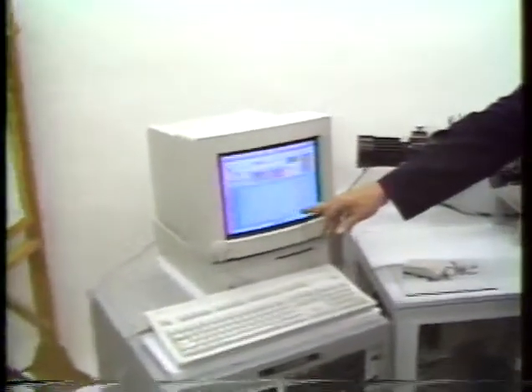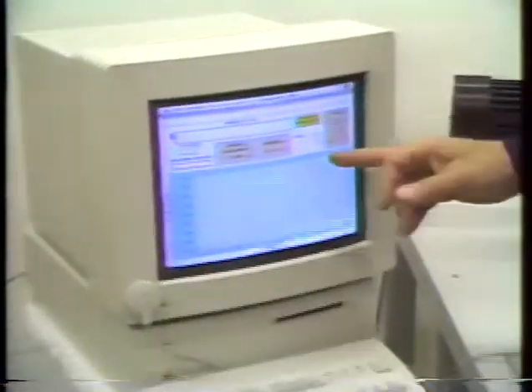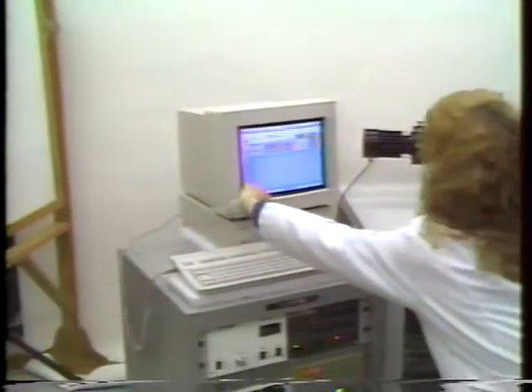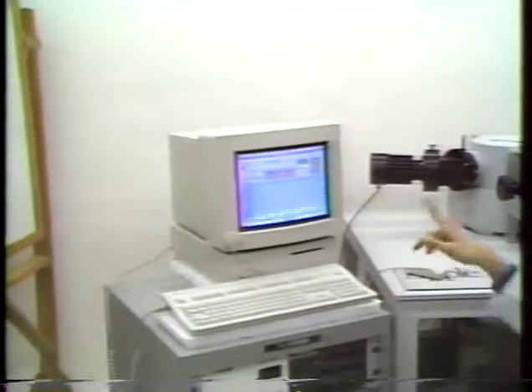These are steps of the 2 nanometers, which we had indicated before is the stepping speed of the scan, right? And we always see the step advance indicated on that particular stepper controller. For your reference scan, you bring the voltage here. Right. So you see. Okay, very good.